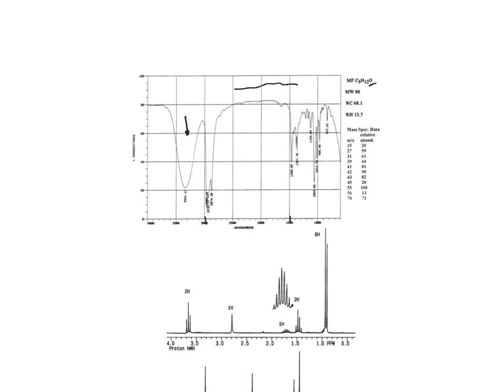So specifically, I look at this and I know that this is a broad signal. There is no carbon-oxygen double bond, right? We don't see that over here at all. It's not as broad as a carboxylic acid. So this has to be an alcohol, right? So that oxygen is coming from the alcohol, and that's also what I want to see in the IR spectrum. I want you to tell me this signal right here is because of this. And that's it. And that's what I expect for each one, right?